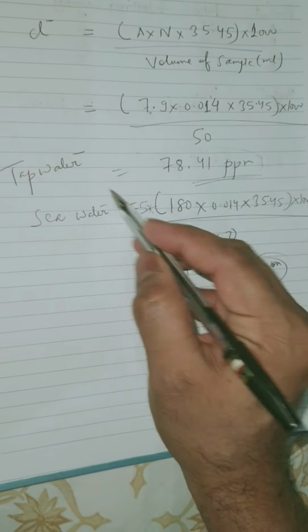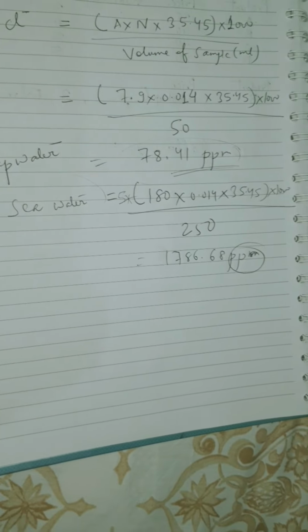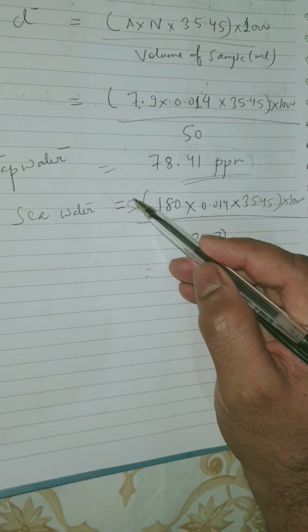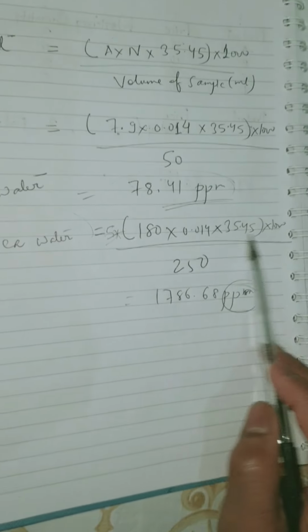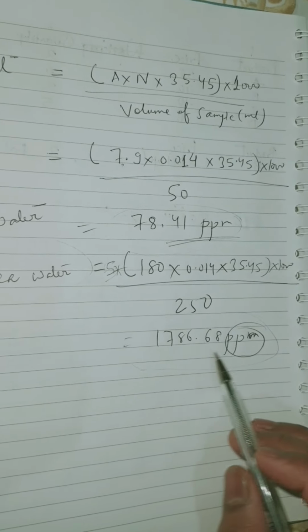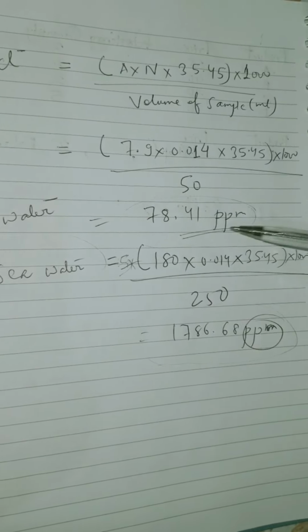In contrast, if we see the seawater, which has a high amount of chloride, and we diluted that 5 times, this number is very high. You can see this is 1786.68, which is very high compared to the tap water.